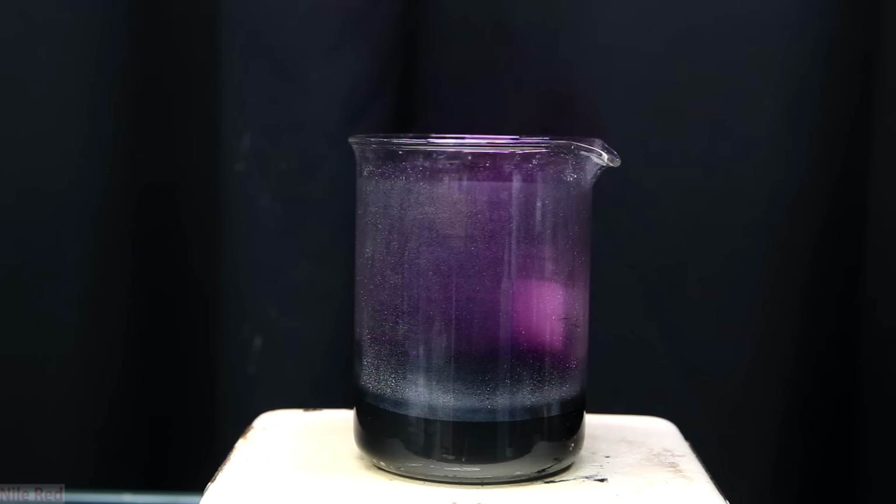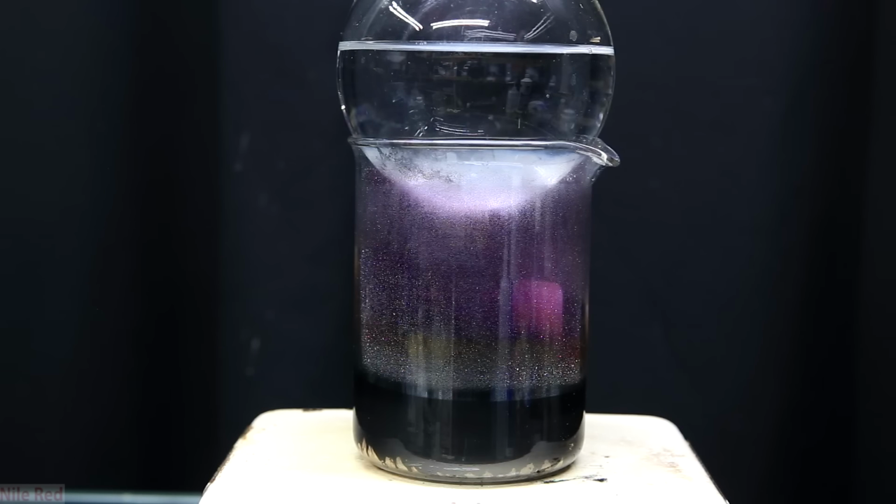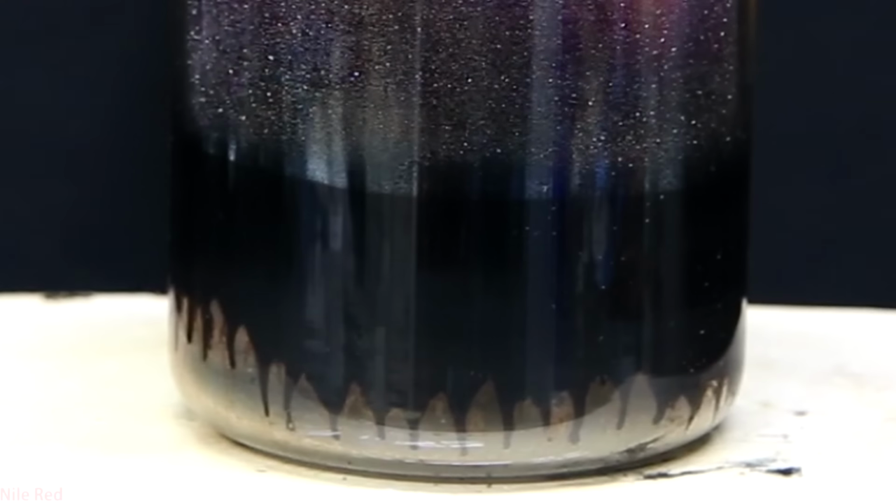Just to show you why we use the flask, when it's removed, purple vapor comes out. Eventually though, it will reach a height where it becomes very evident that there's a liquid recondensing. This isn't water or some other solvent that I didn't separate, this is actually liquid iodine.